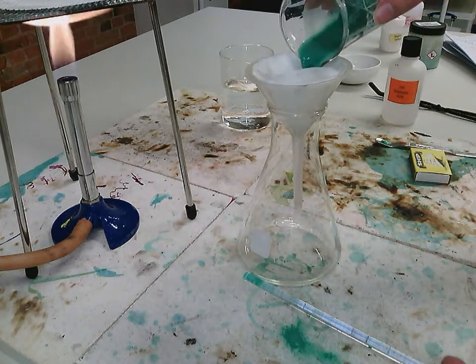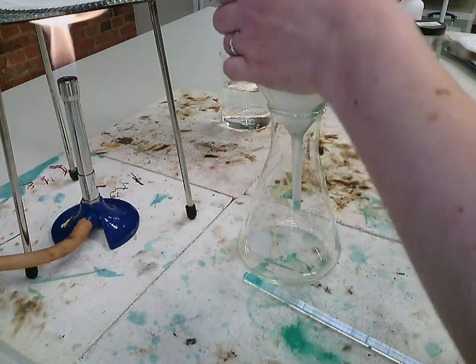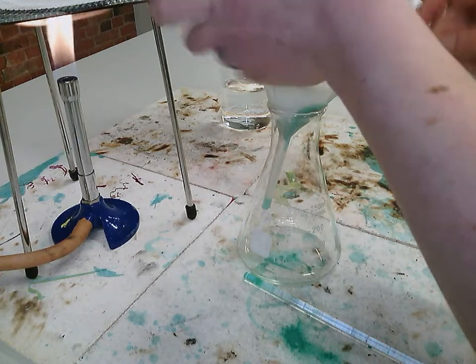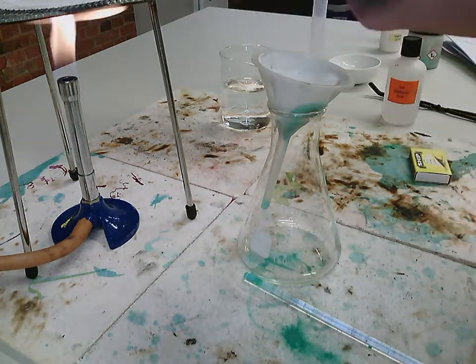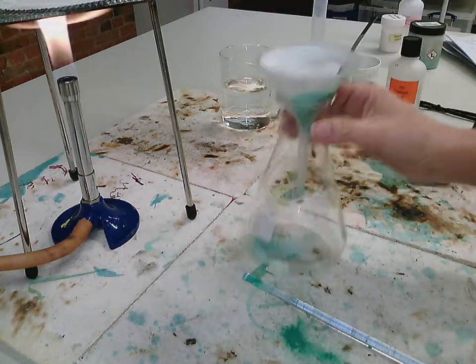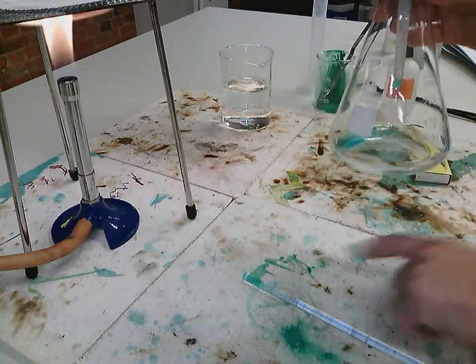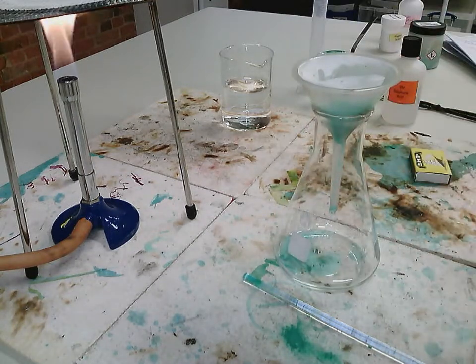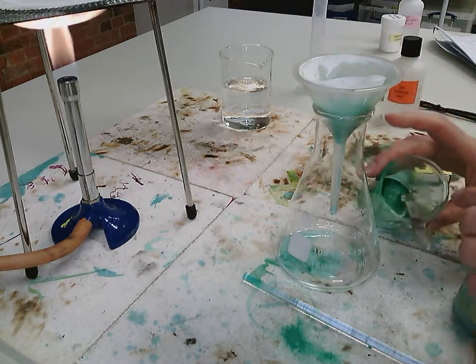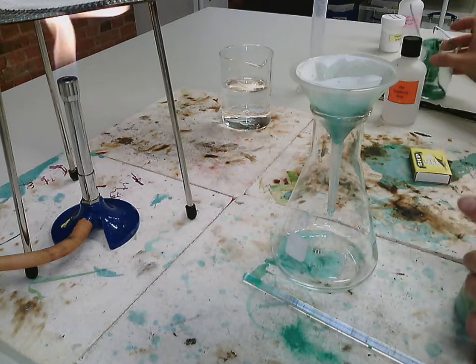So what I'm doing next is I'm getting rid of all my excess copper carbonate. Like I said, I added in more copper carbonate than I needed. I kept adding it until the fizzing stopped. And this was to get rid of all the excess sulfuric acid. So what I do then is I start filtering it. And you can see it's this gorgeous blue colour. Same blue that's all over my trays here. So copper carbonate goes from green, which is this colour, just like a turquoisey green, to a nice light blue.